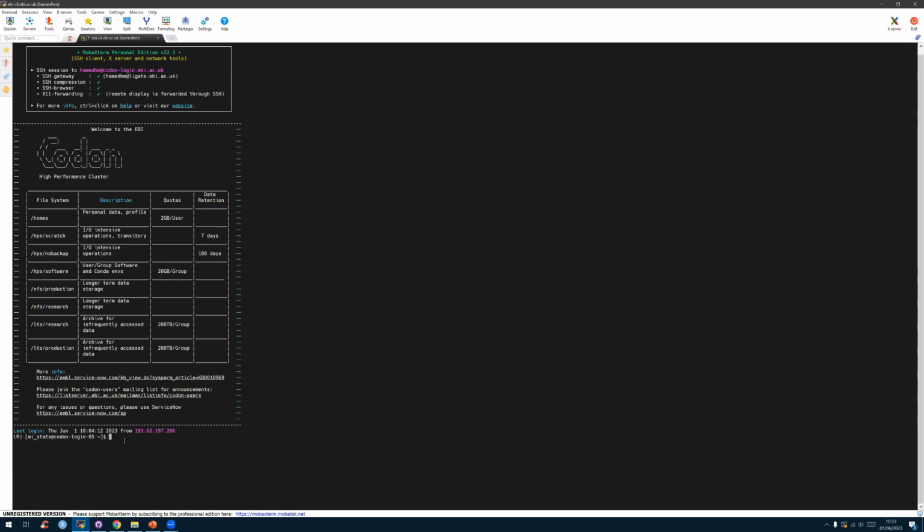So, okay, I just go to cd IMPC, and there should be another directory here. It is called IMPCDRs. And if you dir here, you see that all the stats results from the previous data releases are here. I created a directory for data release 19.1. This is the convention: stats pipeline underscore input underscore data release with the version.